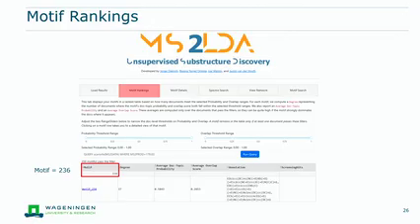I'm now wondering if you can see the bottom row in the back. I hope so. Yes, they are below the motif header. You can type in any number.